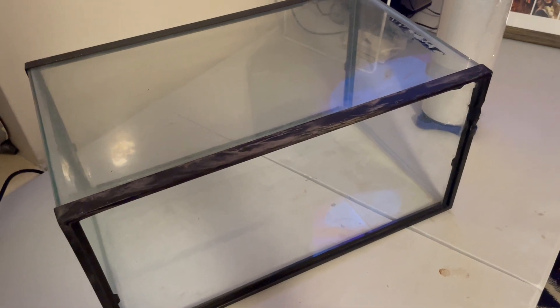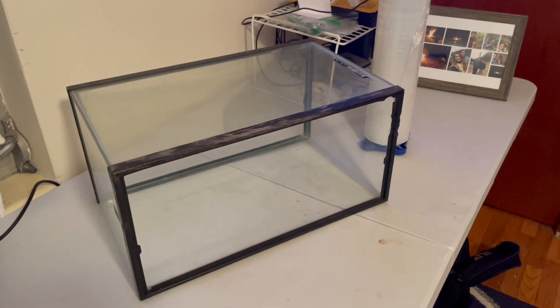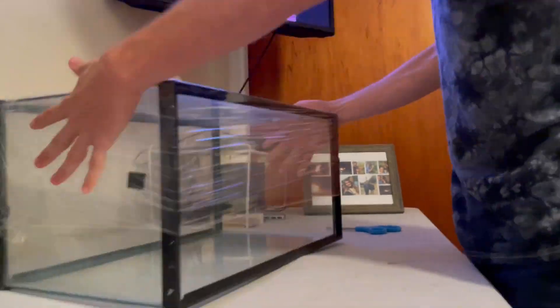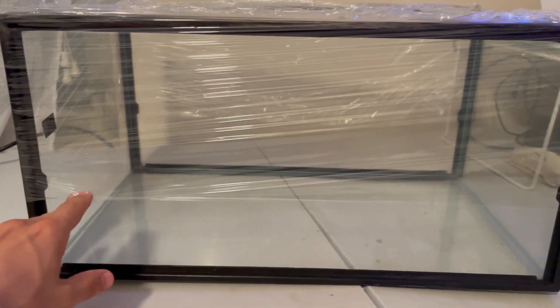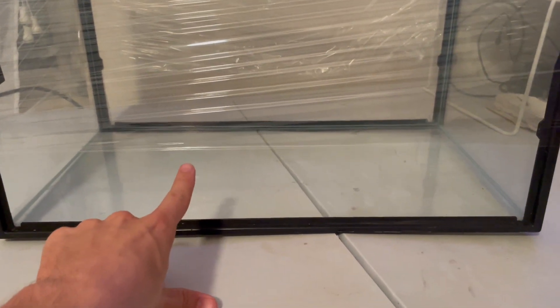So I'll go ahead and show you what I do with the wrap. As you can see, I wrapped it around the top two-thirds of the open face of this fish tank, giving me the bottom third to stick my hands in and move around and do whatever I need to do in there.